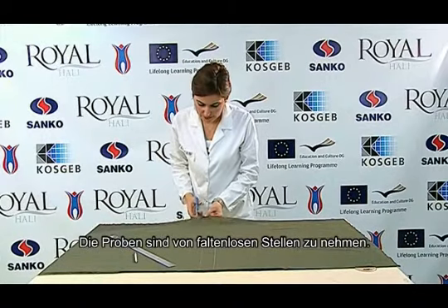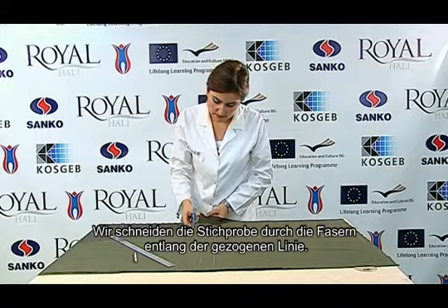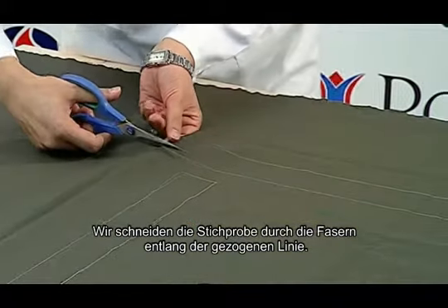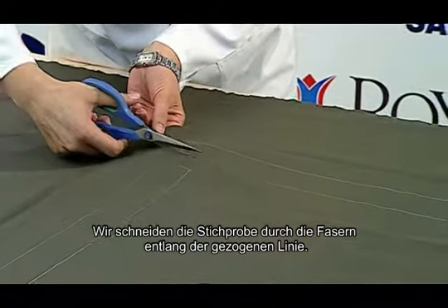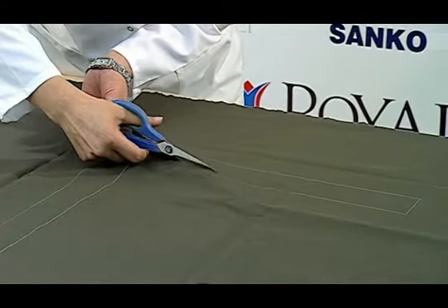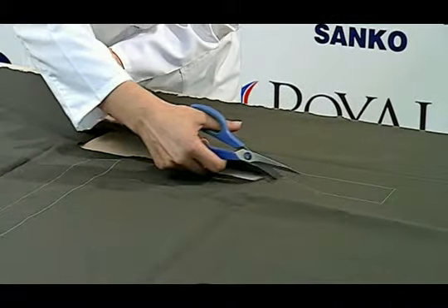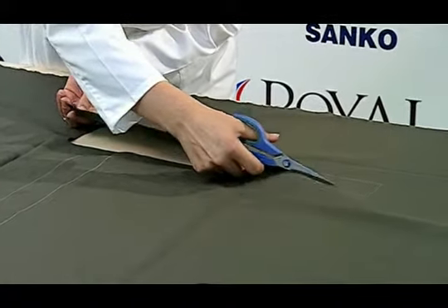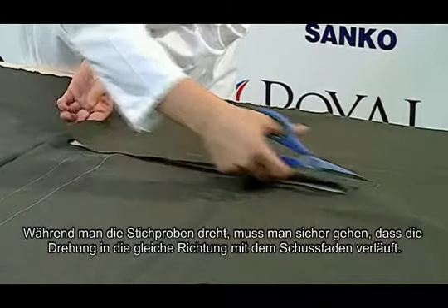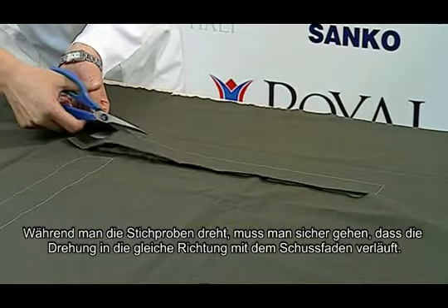Our sample is taken from unwrinkled areas. We cut the sample from the fabric according to the drawn line. While drawing the sample, we make sure that it is drawn in the same direction to the weft yarn.